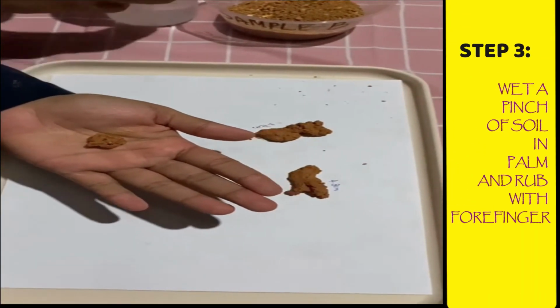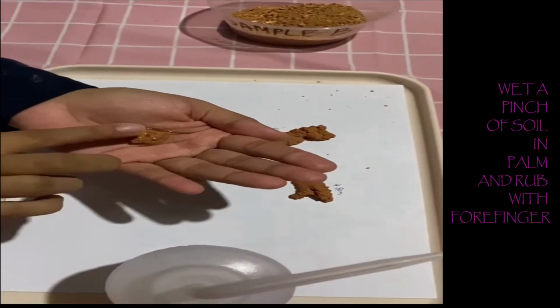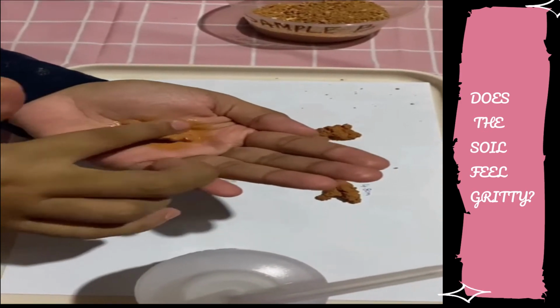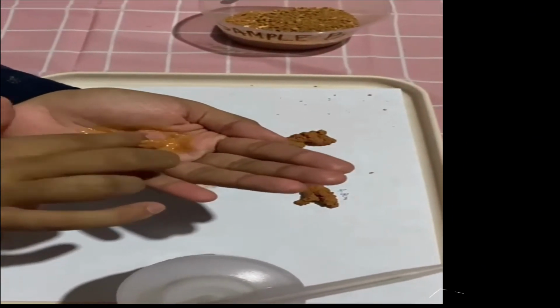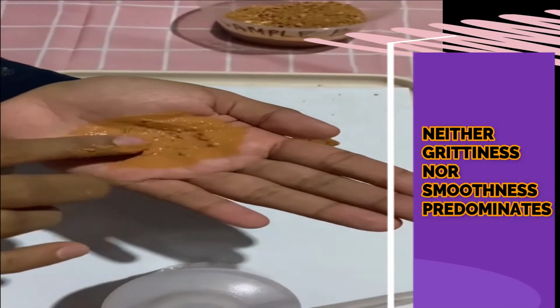Wet a small pinch of soil in the palm and rub with the forefinger. Does the soil feel gritty? Does the soil feel smooth? Neither grittiness nor smoothness predominates.